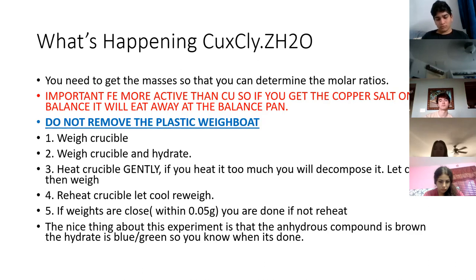Yes. I'll say it again. HCl creates Cl minus ions. So HCl is clear. When I put CuCl in water, it becomes blue. Is the blue color caused by the chlorine? No. So therefore, it has to be caused by what? Copper. So I've got copper in solution making the color blue. Keep that in mind.